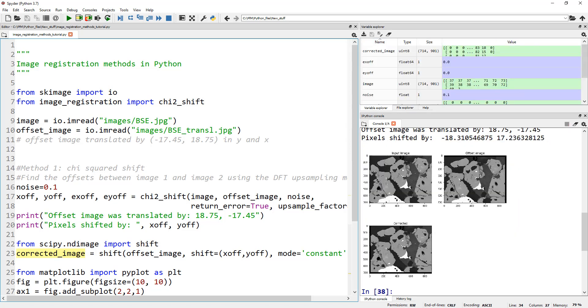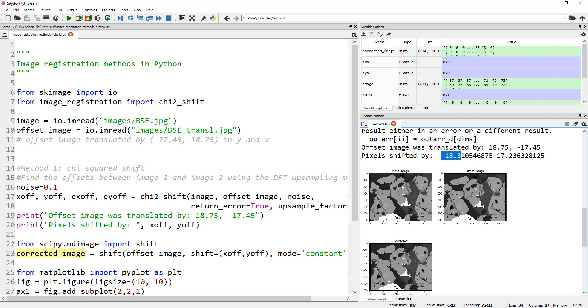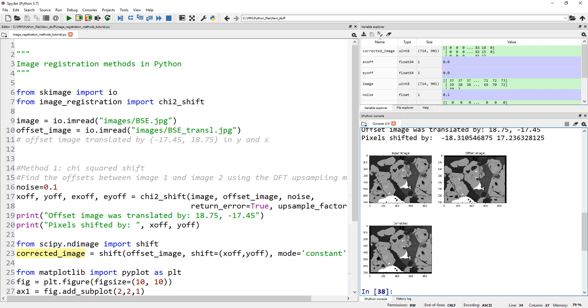It says the pixels are shifted by negative 18.31, whereas the correct answer is 18.75. So not bad. Sub-pixel, it could do a little better job, but down to a pixel level, it did a good job. And 17.23 versus negative 17.45 - this is very close. Here is our corrected image shifted in that specific direction.